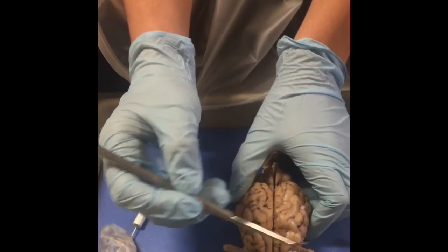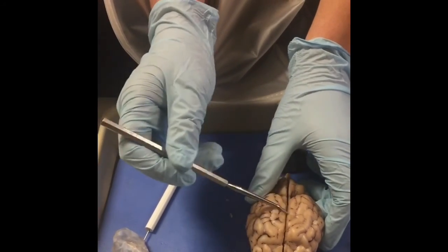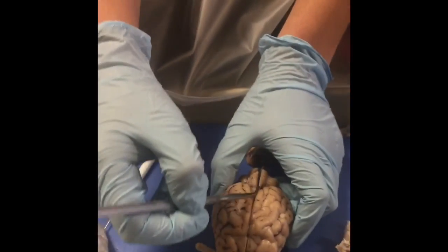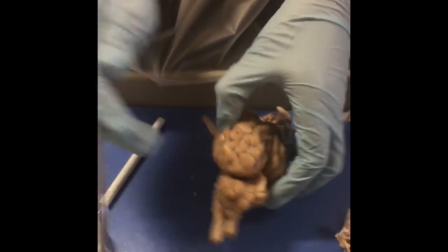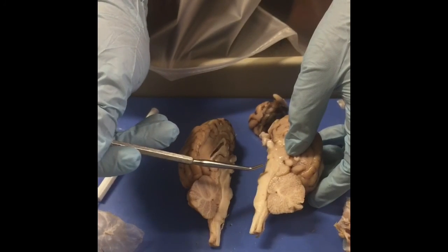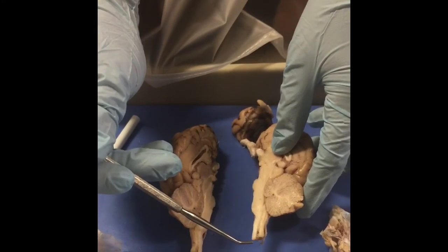At the front of the cerebrum, we have the frontal lobes, and then the temporal lobes on each side, and the parietal lobes on each side, and then the occipital lobes on each side. And right down the center of the brain, we have the longitudinal fissure, and then the back, separating the cerebrum and the cerebellum, is the transverse fissure. And then on the bottom of the cerebellum, we have the brainstem, which is divided into the midbrain, the pons, and the medulla oblongata, which tapers off into the spinal cord.